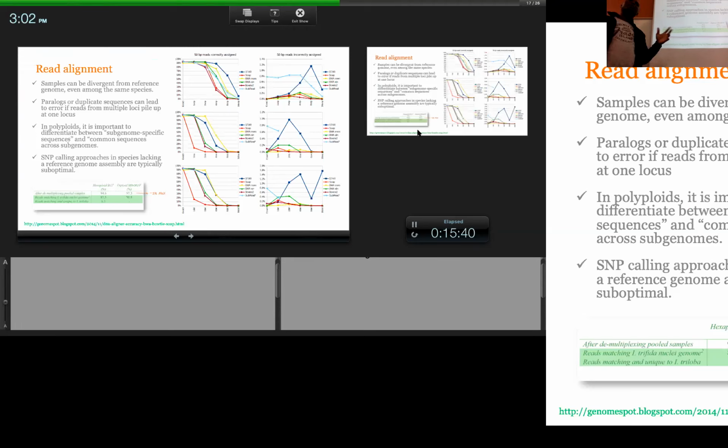And you put about 5% of that into your library. So effectively, you're demultiplexing and recovering pretty much all the reads you've sequenced coming from your sample, right? Or at least close to it, right? Because even though you're spiking with 5%, it might technically be more like 3% or 6%, you know, depending on how good your pipetting skills are.